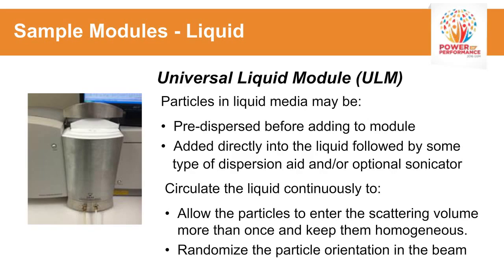These can be pre-dispersed outside the instrument, or you can add a dry powder or a suspension directly to the module. So if you want to prepare the sample in the module, you can do that. Since it has built-in sonication, you can control the power and the sonication time and so forth appropriate to the material you're going to be analyzing and what might be part of an SOP. This would all be controlled by the computer.